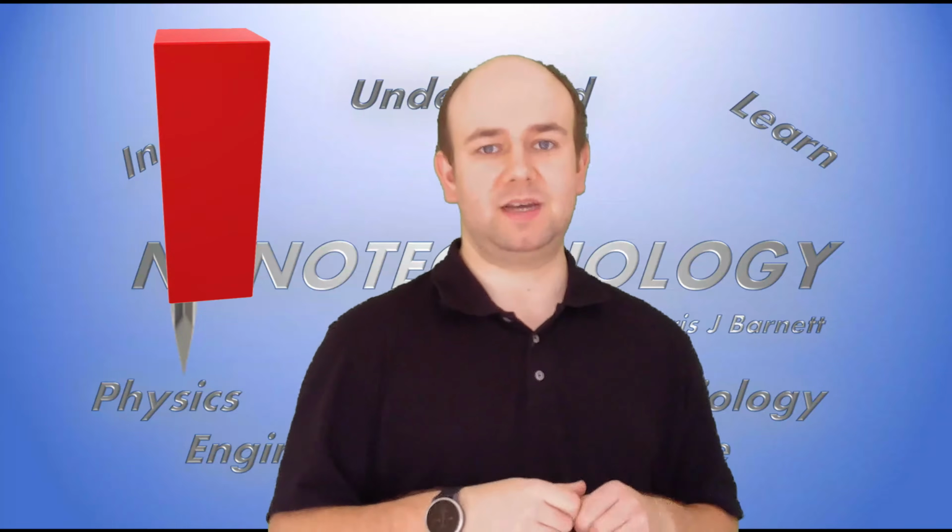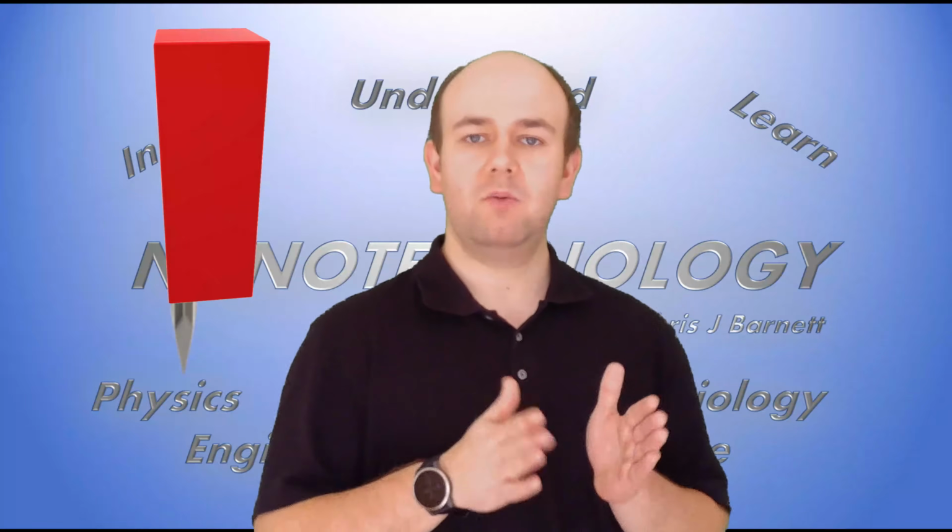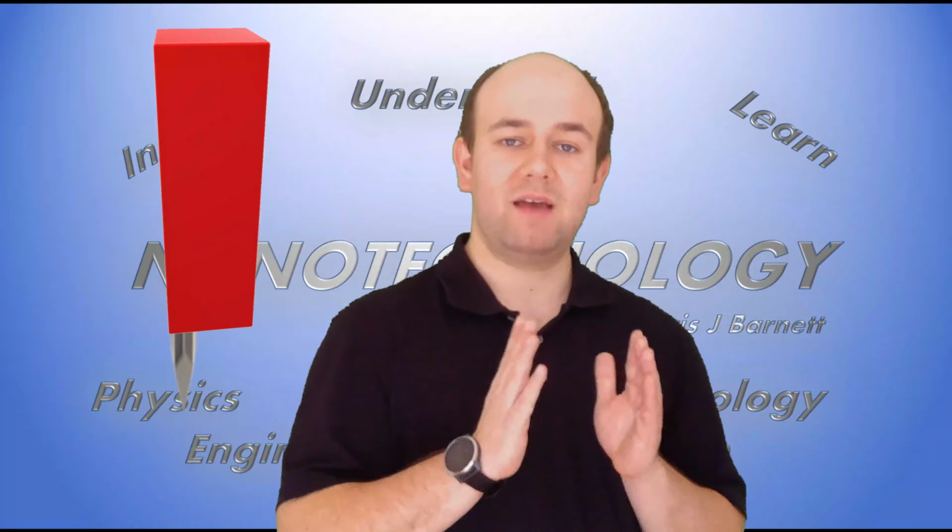So the way an STM works is that the tip, or the tungsten probe, or I'll just refer to tungsten for this video, is mounted onto a material which is called a piezoelectric material. These materials alter when an electric voltage is applied across them. So when a voltage is put across a piezo material, it grows in certain directions, which means we can use a piezoelectric material with a tip attached to it to be able to move that tip very small amounts.